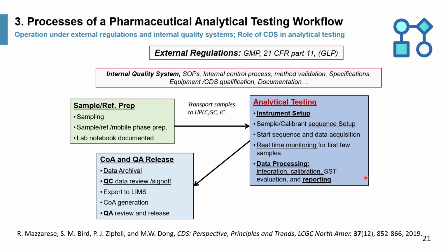And a lot of these are done by the CDS using an instrumental method to set up the instrument. Typically having a method to do a single point connection and control, right? So the CDS can control all the modules, and you also load up the sample calibration and the sample sequence setup.